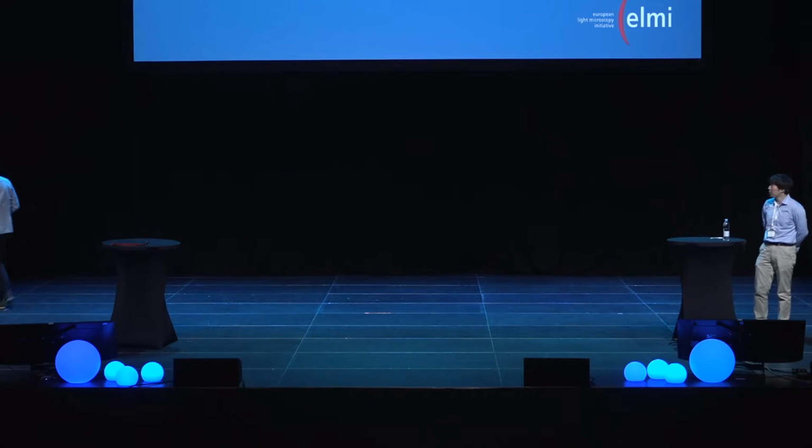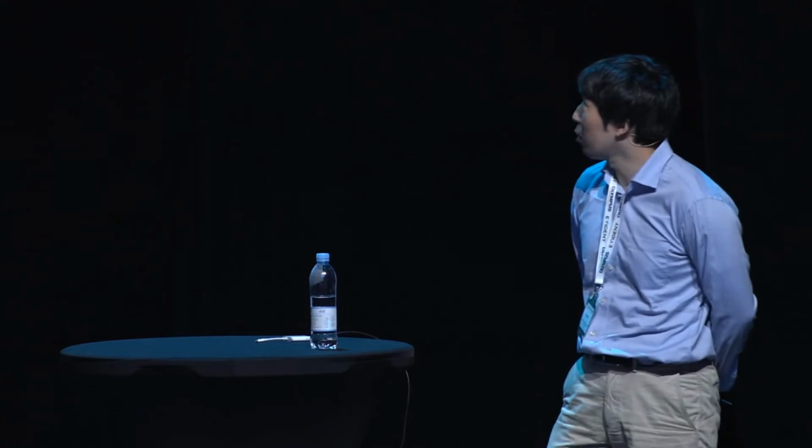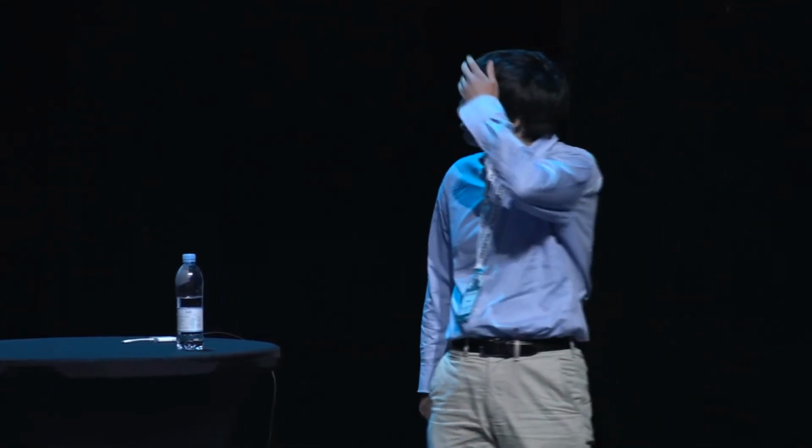Hello, everyone. My name is Ko Sugawara. I'm a postdoc working at IGFL Lyon. And I really appreciate this opportunity to share our work today. In this talk, I will introduce ELEPHANT: tracking cell lineage in 3D plus time by incremental deep learning using a sparse ellipsoid annotation.